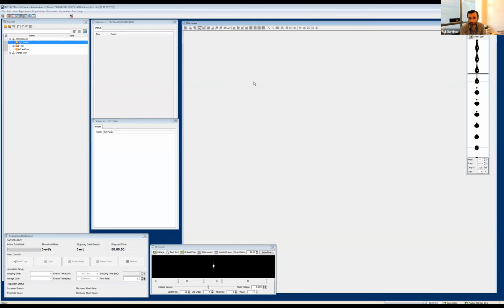Right, very important. Another question, from an anonymous person: in our facility, we adjust the phase value to adjust the drop one value. Is there an impact when the phase value is set to 0? I'm not sure if they're talking about an ARIA, where you don't adjust the phase, you adjust the amplitude, or another instrument.